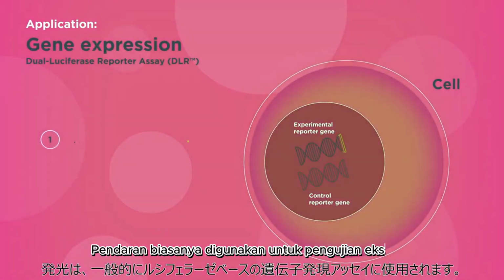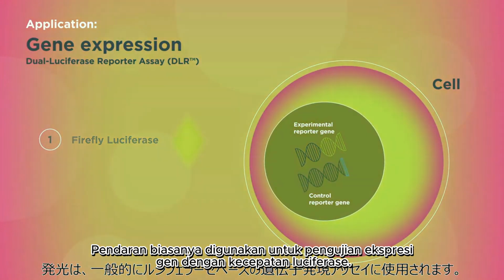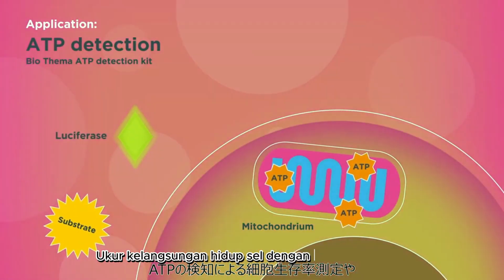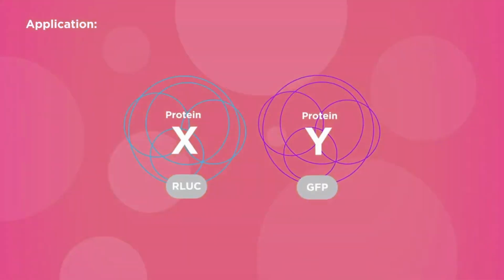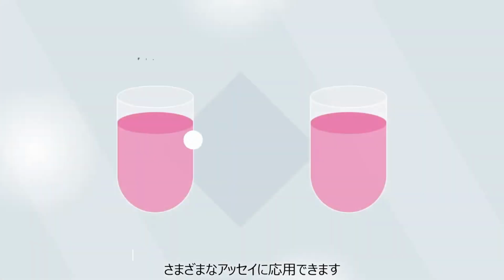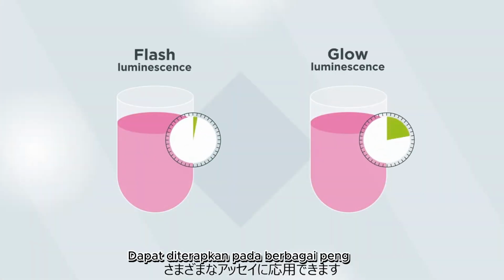Luminescence is commonly used for luciferase-based gene expression assays, ATP detection, or for monitoring protein-protein interactions. Different forms of luminescence reactions can be used.